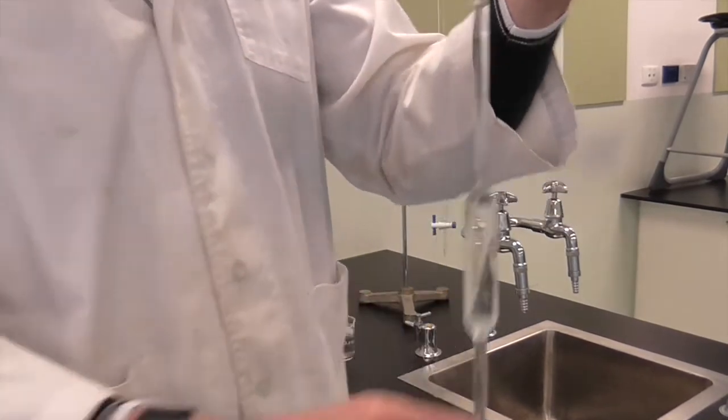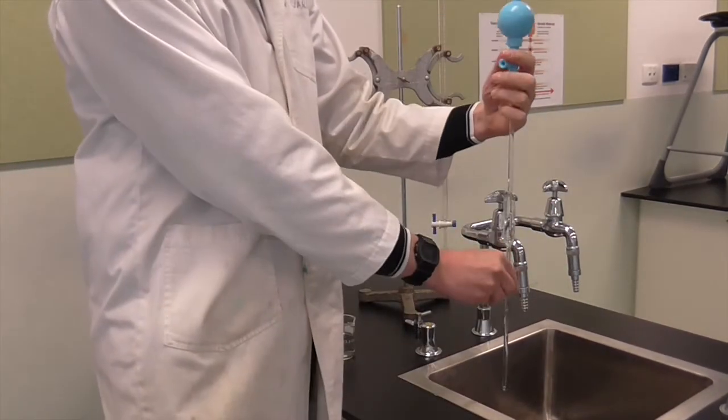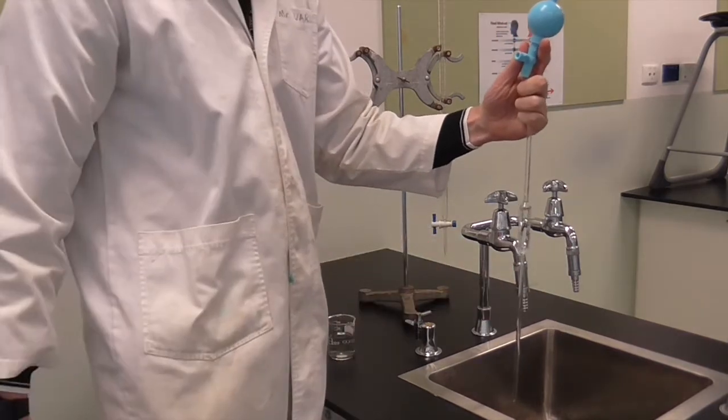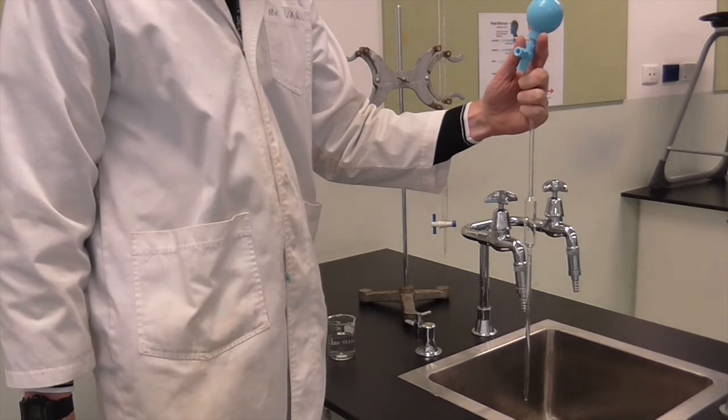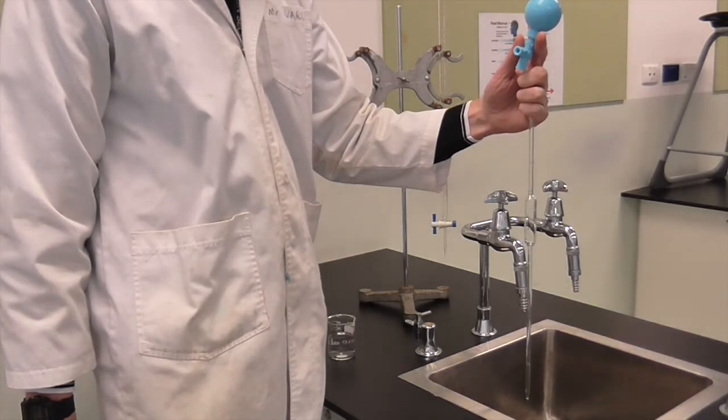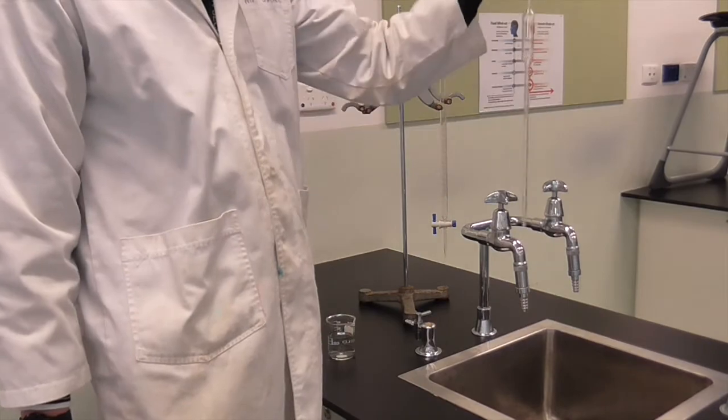Now I'm going to take the pipette over to the sink, remove the pipette filler, and drain out. You need to repeat this process, both rinsing up halfway through the bulb and then above the etched line, at least once with the solution that you're going to place into the pipette. This prevents dilution of that solution.